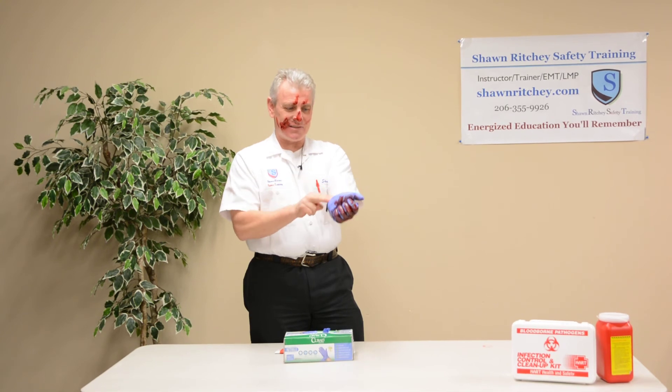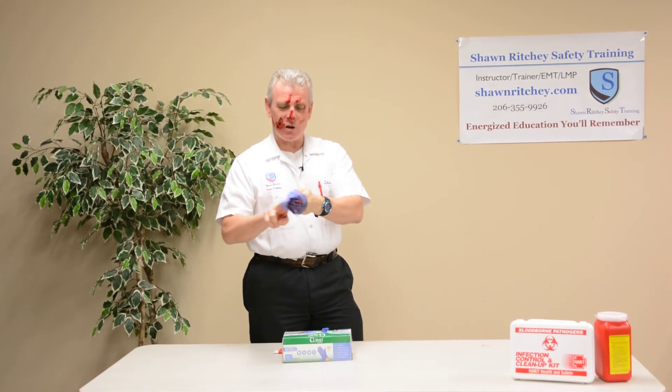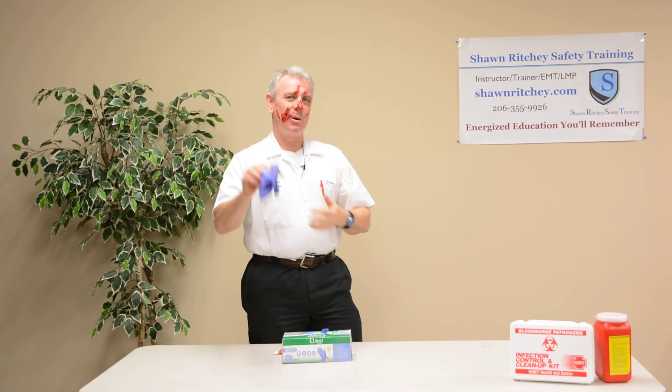Skin-to-skin now means I can come in contact with my own skin. I turn that inside out, pull it off, and I haven't touched the outside contaminated surface of either glove.